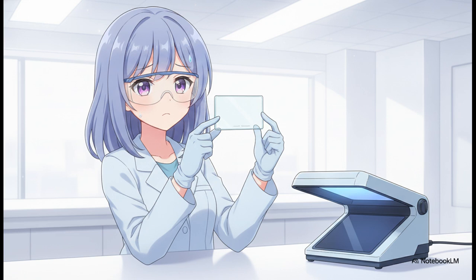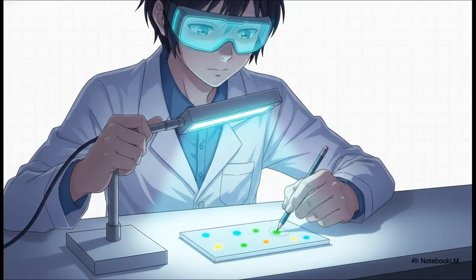But don't worry, chemists have a spectacular solution, and it is honestly my absolute favorite part of the process. We are going to use a UV lamp to reveal the hidden chemistry. When we place our blank plate under a specialized UV lamp, something truly magical happens. Compounds that contain systems of pi electrons will absorb the UV light and visibly glow, or they'll create really dark shadows against the fluorescent background of the plate. Suddenly, our invisible chemical finish line just lights up.